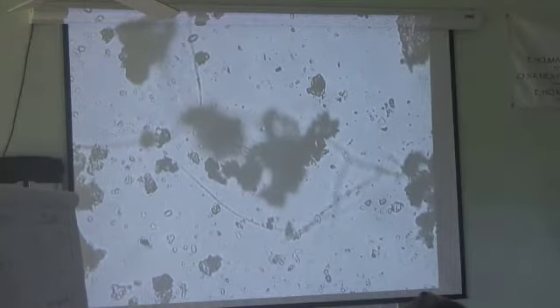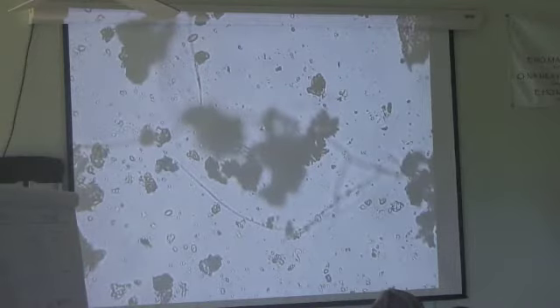And now you're going to close your other eye, and you're going to focus on something in here just as sharp and clear as you possibly can. You're going to memorize what that looks like, because now we're going to close that eye, and we're going to use the focusing mechanism on our other eyepiece to focus that in just as sharp and as clear as it can. Both of my eyes are in the same plane of focus. If you do this, you will prevent yourself from getting massive headaches.